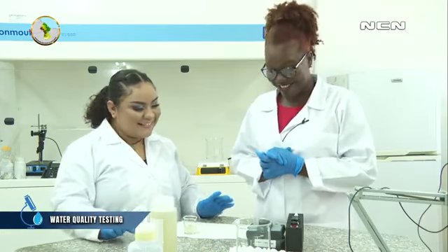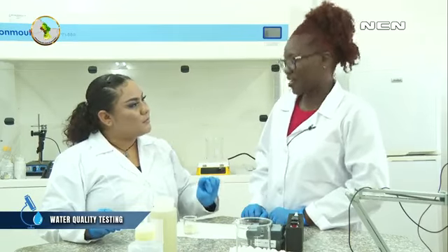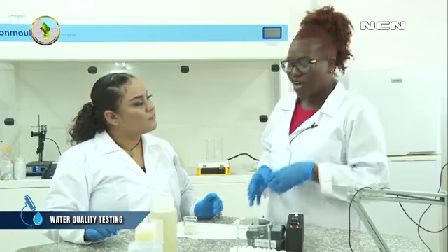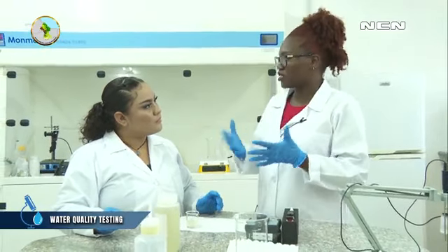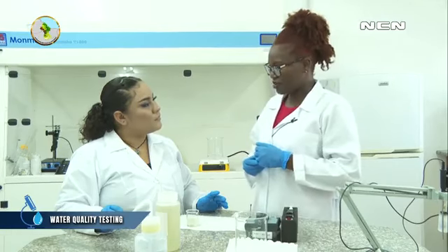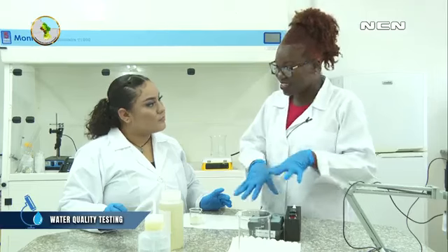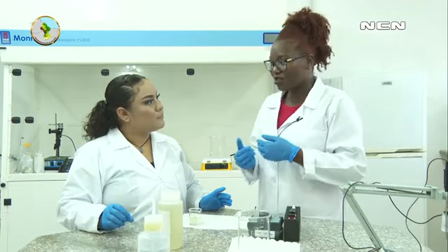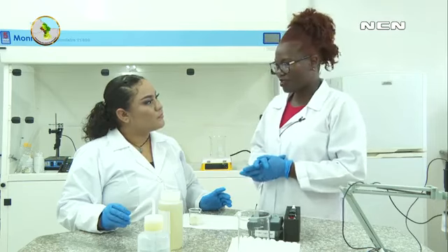Crazy. Exactly, very crazy. So it could be like 5 and below. If we test bottled water, it's supposed to be 5 and below. Municipal water, which is water that the government supplies for us to drink, is supposed to be 5 and below. Right? So now that we've finished with our turbidity, this is telling us, okay, we can't drink it. But let's test to see if the pH will also stick to that point that we're supposed to be drinking.